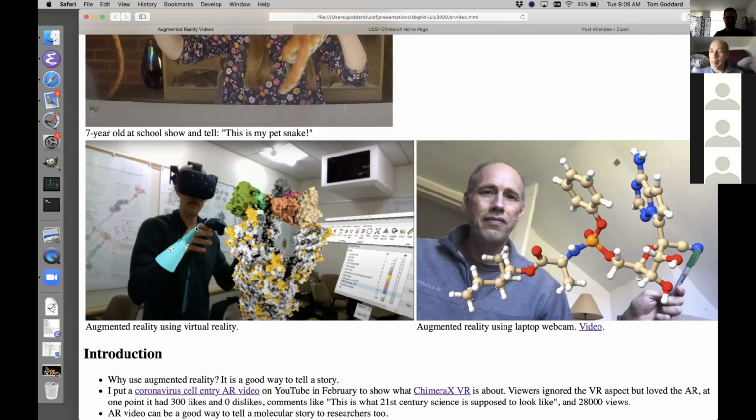Okay, so I'm going to switch computers to my virtual reality computer. I'm on a Mac now, and Mac can't really do VR very well, so I'm going to switch to my Windows computer and screen share and show you what this augmented reality looks like. And then I'll explain how it's done. I'm going to show two techniques. I'm going to show you the technique to do the augmented reality where I have a VR headset. The drawback of that is you probably don't have a VR headset. And not only is it a VR headset, it's using some fancy depth sensing camera, even more exotic equipment. But after that, I'm going to show you something I just added, which will let you on your laptop, just with your webcam, do some augmented reality video. Okay, so let's get going here.